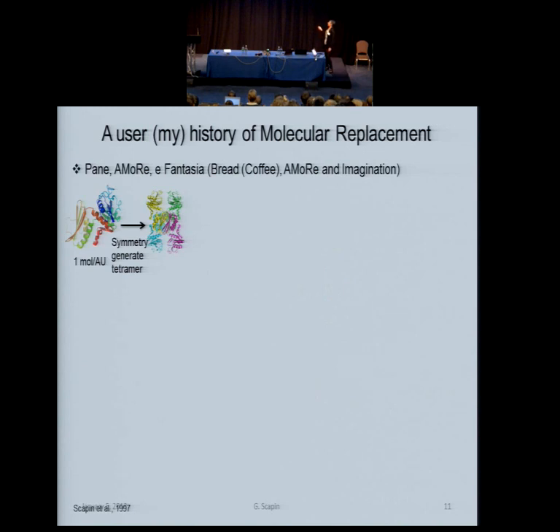It was known that the biological form was a tetramer. In my tetramer, the protein binds a cofactor and a substrate. The binary complex with cofactor only crystallized with one molecule per asymmetric unit, and a tetramer was generated by crystallographic symmetry. About 6 months down the road, I managed to get crystals of the ternary complex, which was what we wanted, because we wanted to be able to devise the mechanism of the enzyme and everything else.